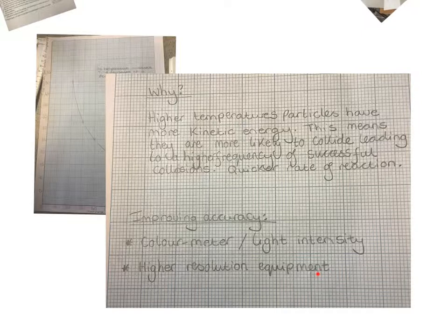With the swirling, you need to either swirl constantly or not swirl at all. And there's also equipment that you can use again to make that more accurate so that every time you're doing a swirl, it's exactly the same force.